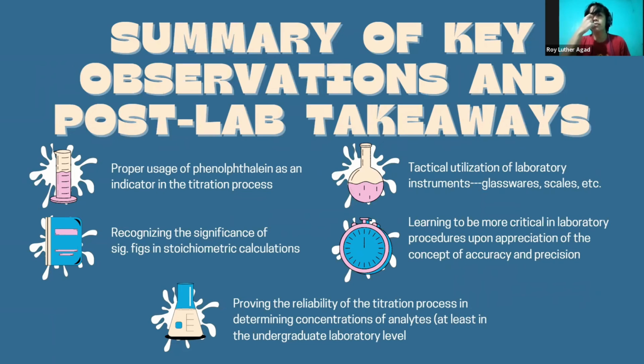Moreover, with reference to the tables and calculations mentioned in detail by Jesslyn earlier, we in the group also generally inferred that digits are very crucial in the process. Significant variations occur even with minute deviations from the intended amounts, say several variations of achromatic, pink, and purple roughly flowing in the glassware, directly proportional to the increment of phenolphthalein being poured per duration.